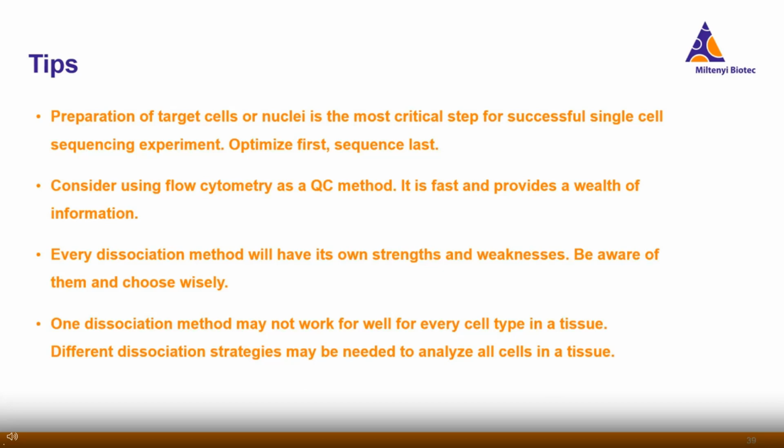I know people have issues with very precious tissue, but especially if you're working with mice, you have the tissue, practice before you start your experiment.